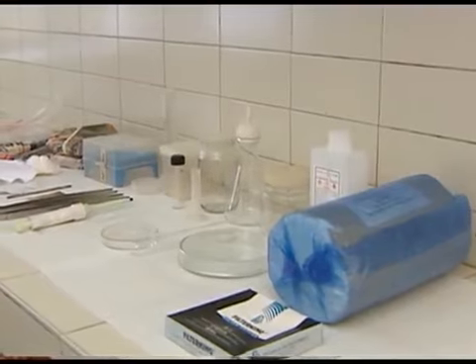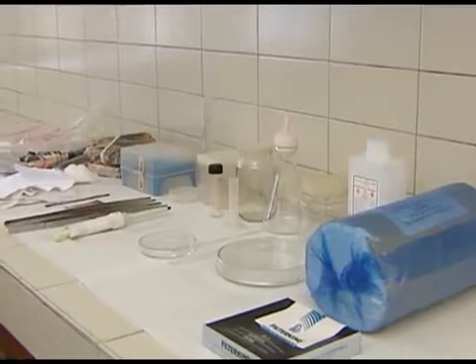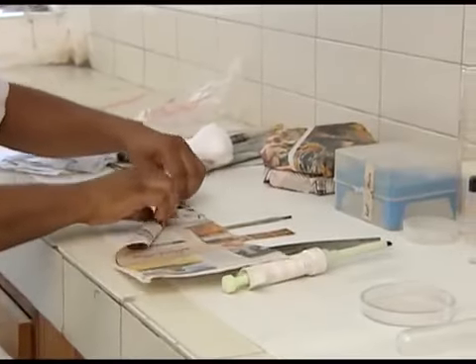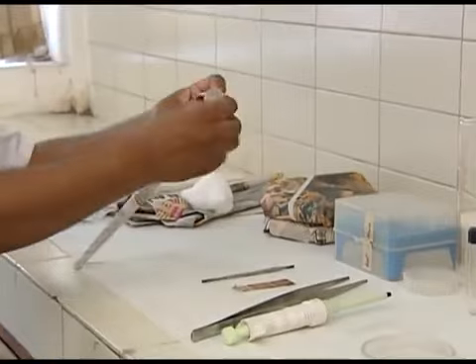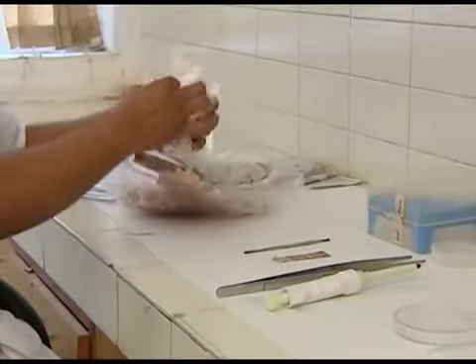First of all, it is important to take all the required apparatus in a spotlessly clean condition. These items are then wrapped in newspaper or brown paper with a knot at the side that has to be held by hand. These are then kept ready for autoclaving.